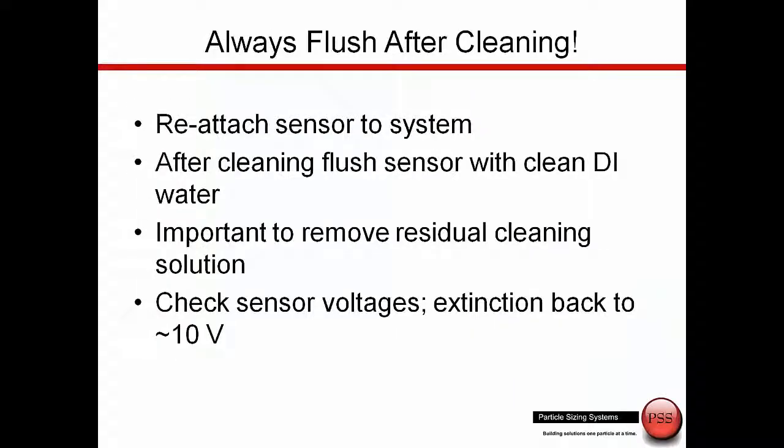Upon completion of the cleaning procedure, we need to flush the sensor. Reattach it to the system and flush DI water through the system to remove any residual cleaning solution.